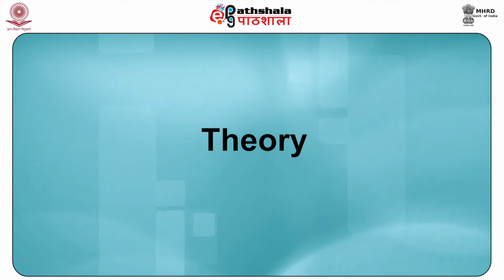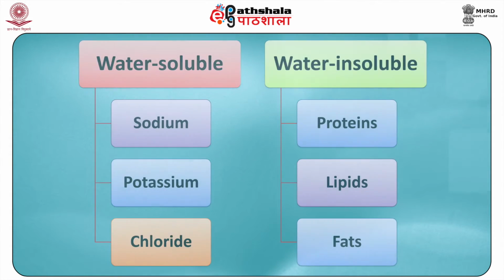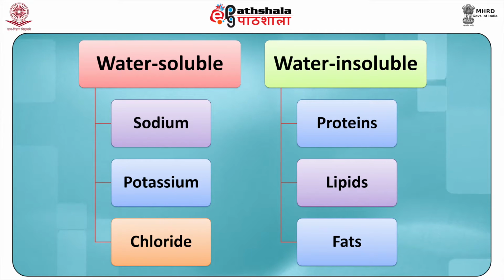Now let us see the theory part. The chemical entities present in fingerprint residue may be broadly classified into two types. Number one, water soluble, and number two, water insoluble. The amino acids and inorganic ions, such as sodium, potassium, and chloride, belong to the water soluble class.